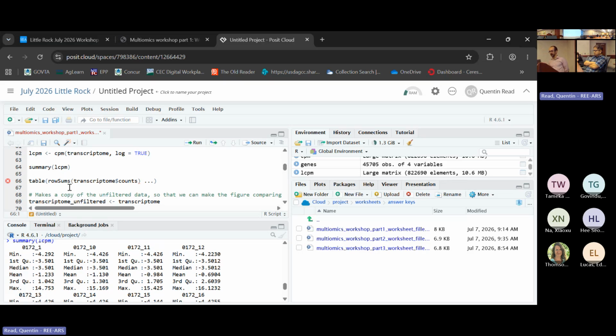every time. But not only do we want to get rid of exactly zero, we also want to get rid of genes that have very low expression, even if it's not exactly zero in all the samples. We still want to get rid of ones that are close to zero in all the samples. How do we define close to zero? We're just going to use default cutoffs here, but in the lesson text, I mentioned the cutoffs that they use and explain them.